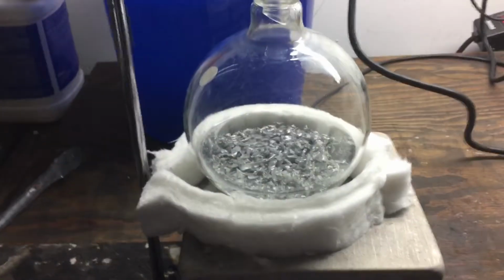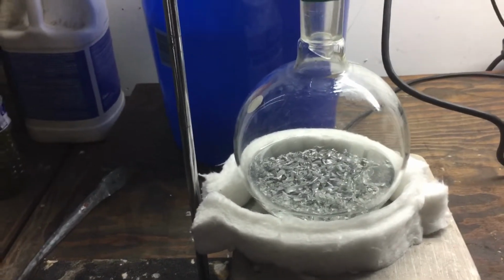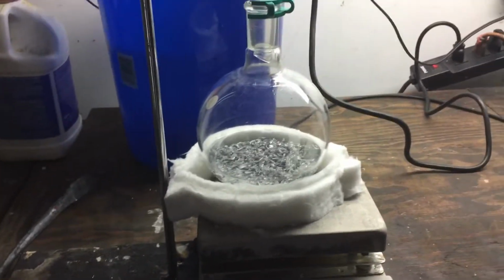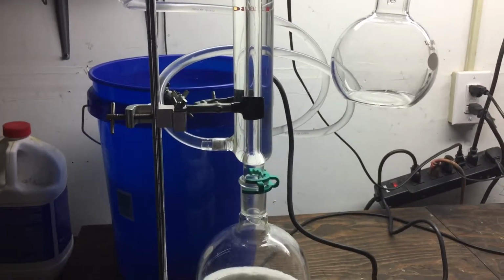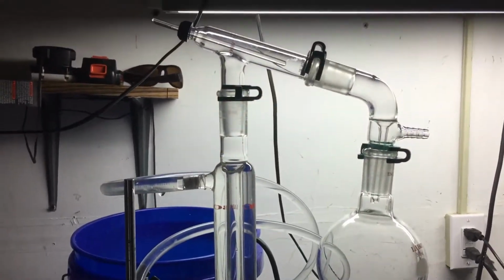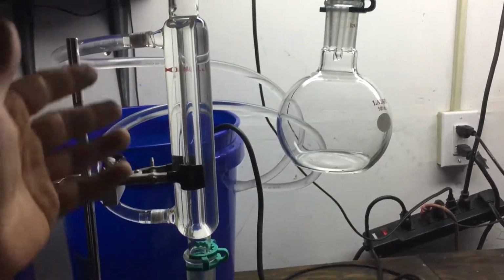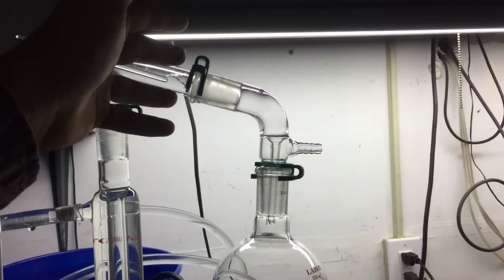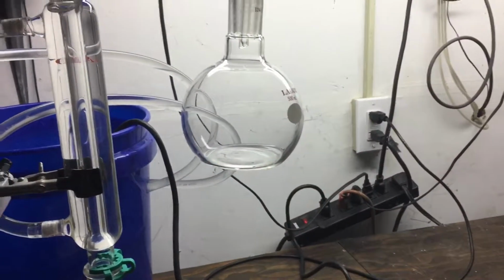I've got this on a heating mantle to help speed up the reaction, and since I'm heating it in this hydrochloric acid, obviously as you heat a liquid with a dissolved gas, the solubility of the gas quickly decreases as temperature increases. So to eliminate any hydrochloric acid vapors being released, I have placed a distillation column above here, and I'm assuming all the vapors will recondense by the time that they reach this column, and it's very likely that they will, but just in case that they don't, they'll go up here, and then they will have definite time to recondense with any water, and if anything does manage to come over, I've got a flask here.